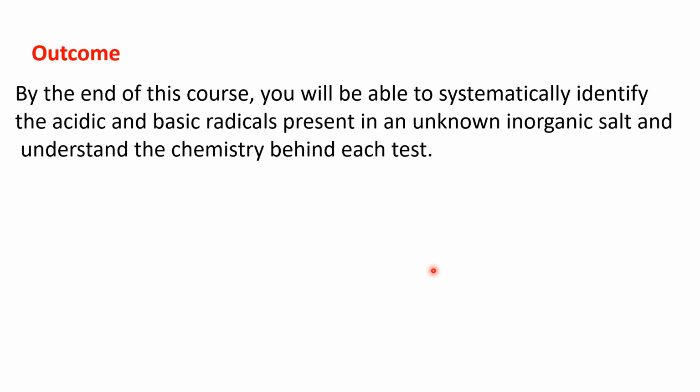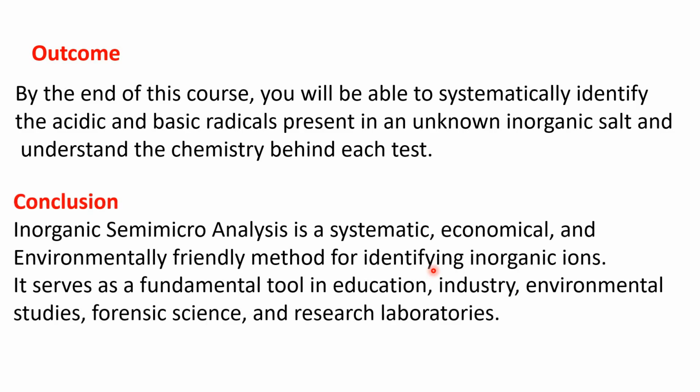Not only a single salt, you'll be able to analyze a mixture of salts also. And finally, the conclusion: inorganic semi-micro analysis is a systematic, economical and environmentally friendly method for identifying inorganic ions. It serves as a fundamental tool in education, industry, environmental studies, forensic science and research laboratories.